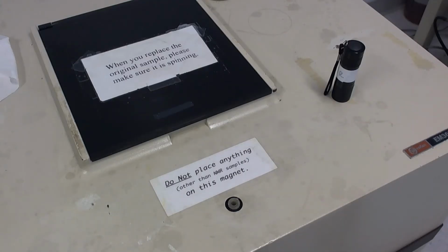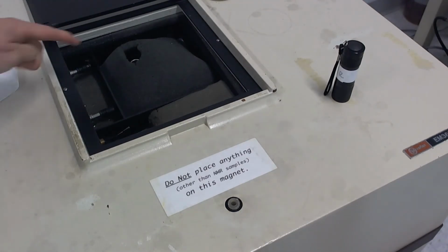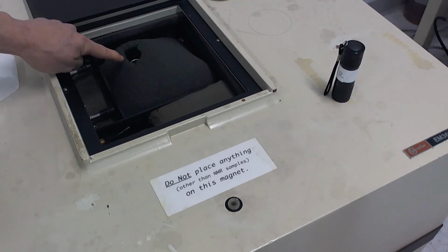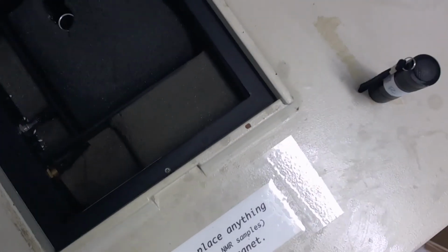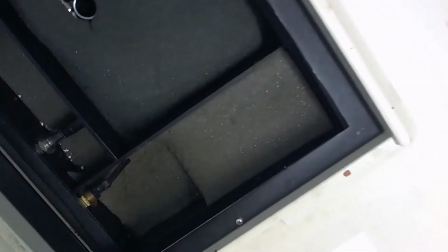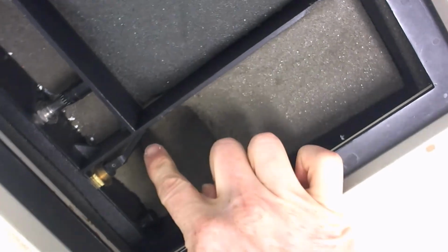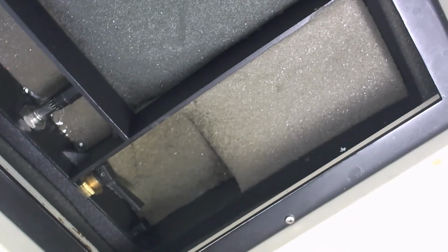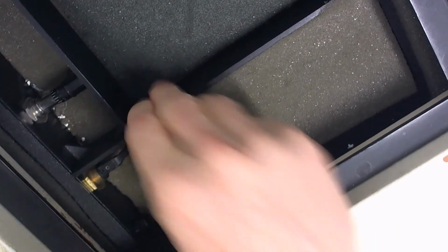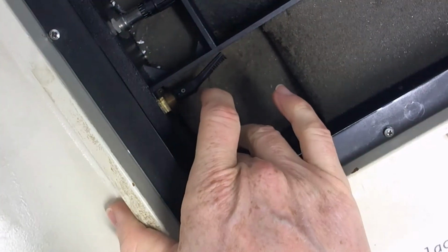Let's look close up at the NMR spectrometer. If we lift this lid, this is where the sample is. Here's a silver tube where the sample is inside. There's a button and a lever, which I'll try to show you close up in a second. The button is here. The lever is here. The lever only goes 90 degrees. It's a little bit snappy. That's putting it back to its original position. The button is here.